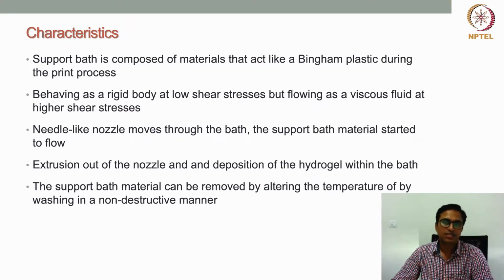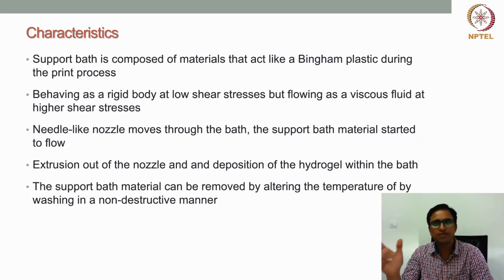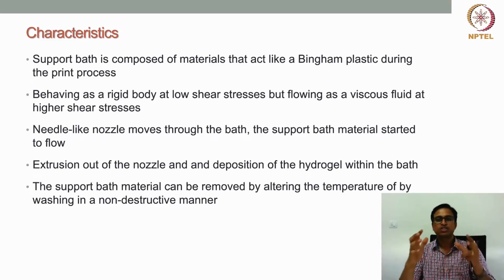The support bath is mostly made up of materials that act like a Bingham plastic during the print process. What is a Bingham plastic? A Bingham plastic is a material that behaves like a rigid body, or solid-like structure, when there is no shear load, no shear rate, or very little shear stress.